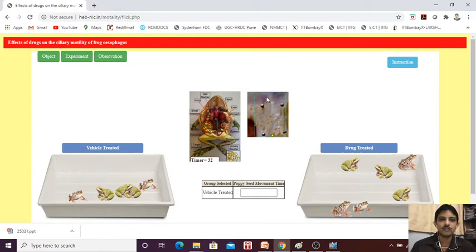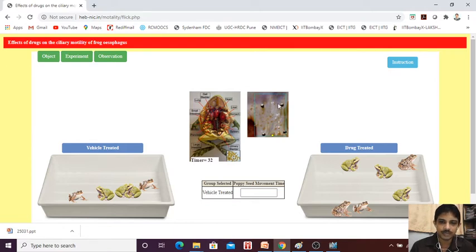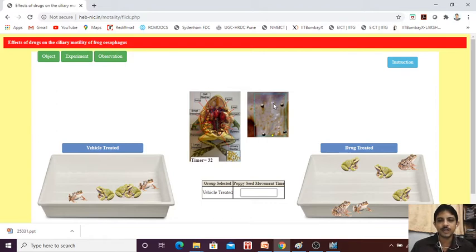Then we are going to take a poppy seed — or mustard seed. We will keep the poppy seed here and what will happen is we will find that due to the peristaltic movement, the poppy seed is moving and it will come to the end.